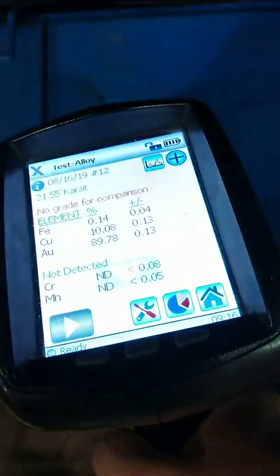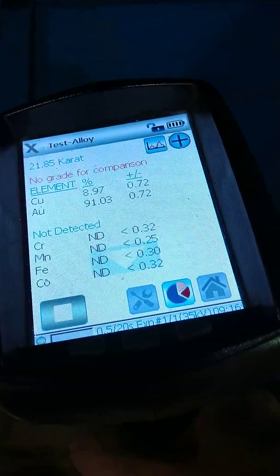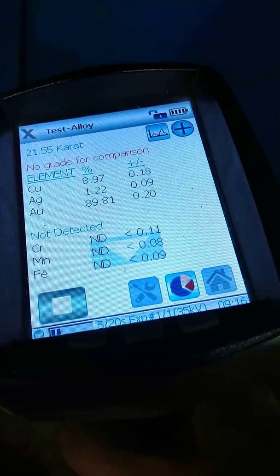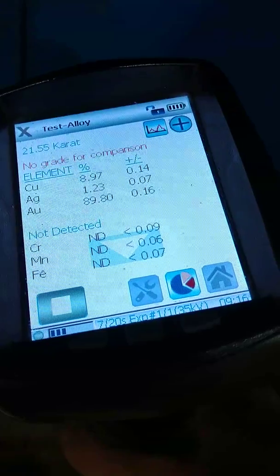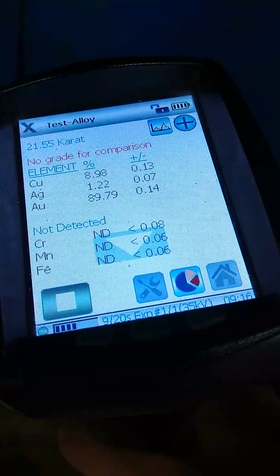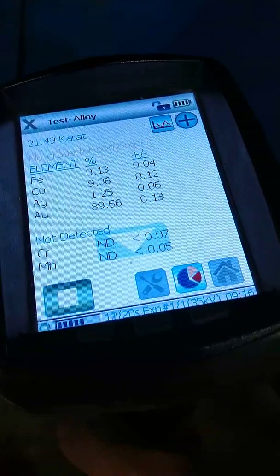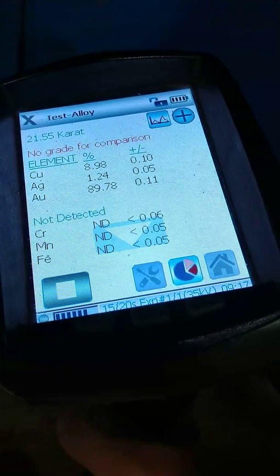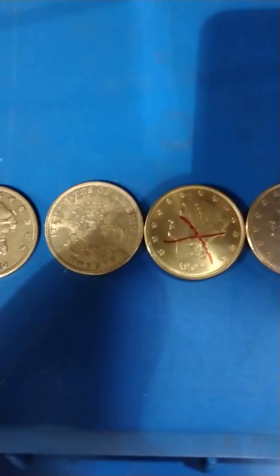Now our second coin — we're going to take an X-ray on that, pull the trigger. That's not supposed to be there. A genuine US coin would not have that silver tracer in there, because the refining capabilities by that point were beyond that. So we know that that one is counterfeit.